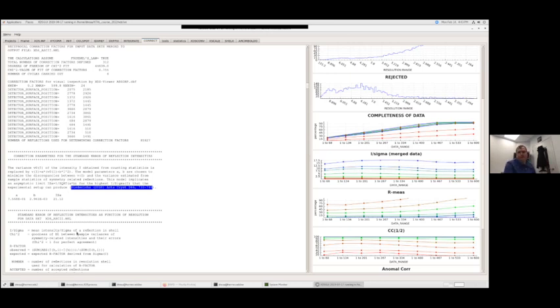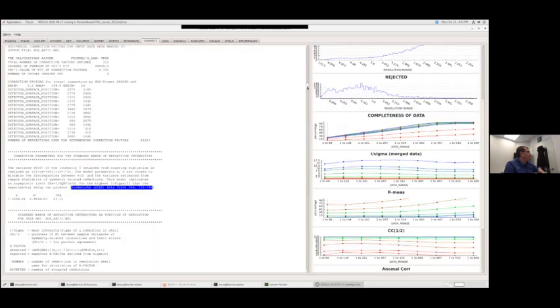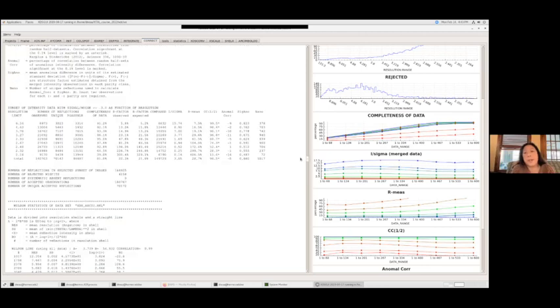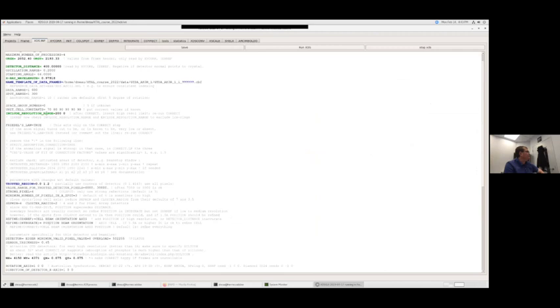Okay, so now things we want to do. One of the first things we're going to want to do is change what resolution we're looking at, right? So we looked at that. That's Catherine's question: how do you reprocess the data with the lower resolution? So we looked at this, we said, oh, maybe we want to cut the resolution somewhere between 2.32 and 2.48. So we're going to go back to xds.inp and this include resolution range, and we're going to change that to say 2.4. Okay, so that high resolution, whatever we want to. All right, so that's where you change the resolution.